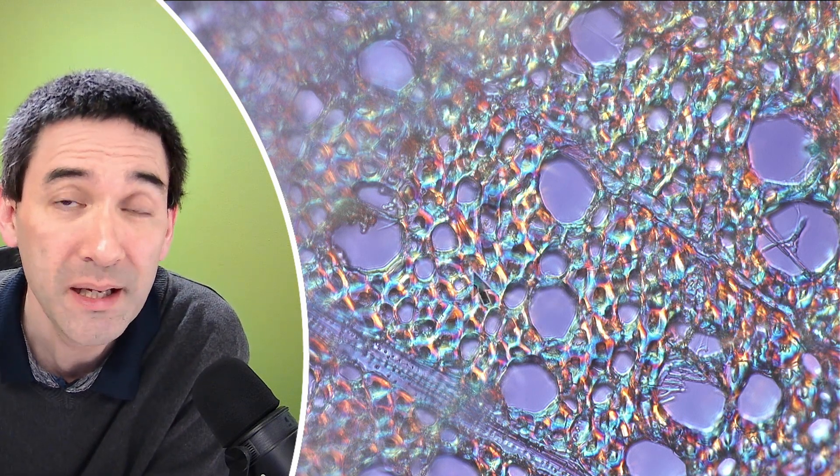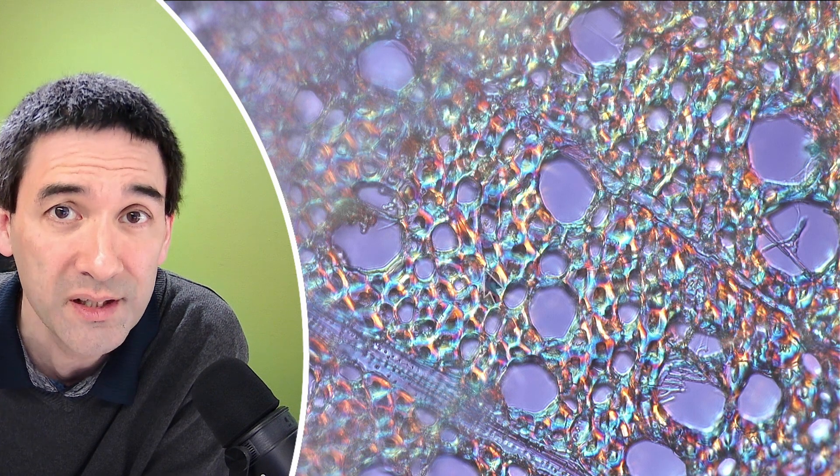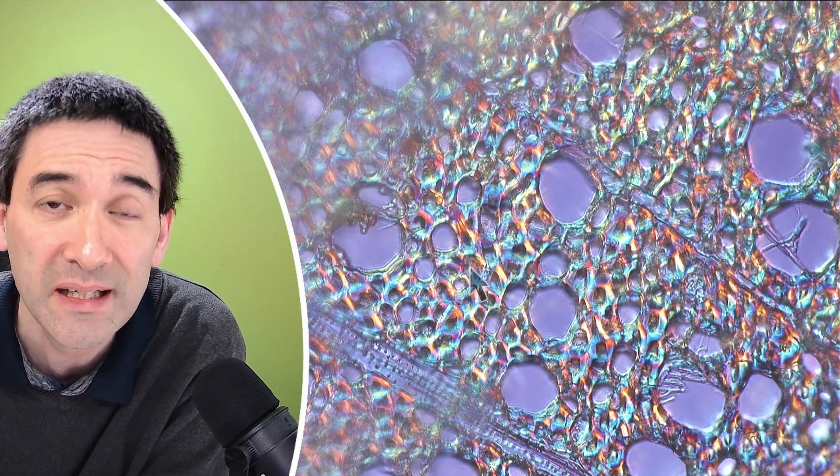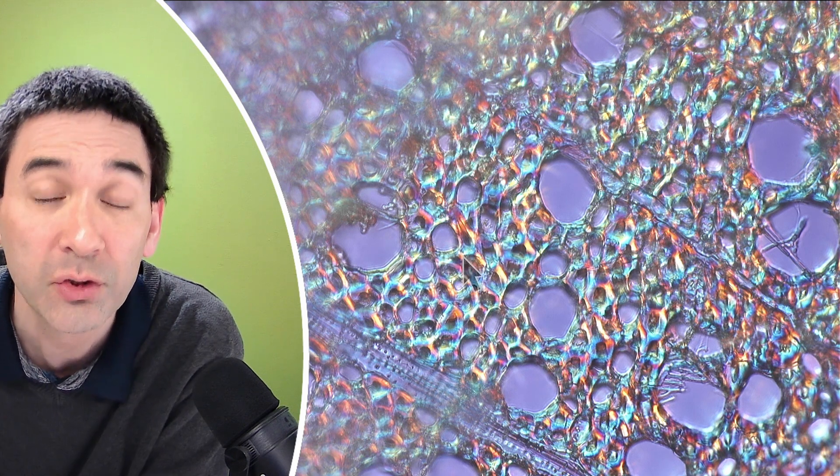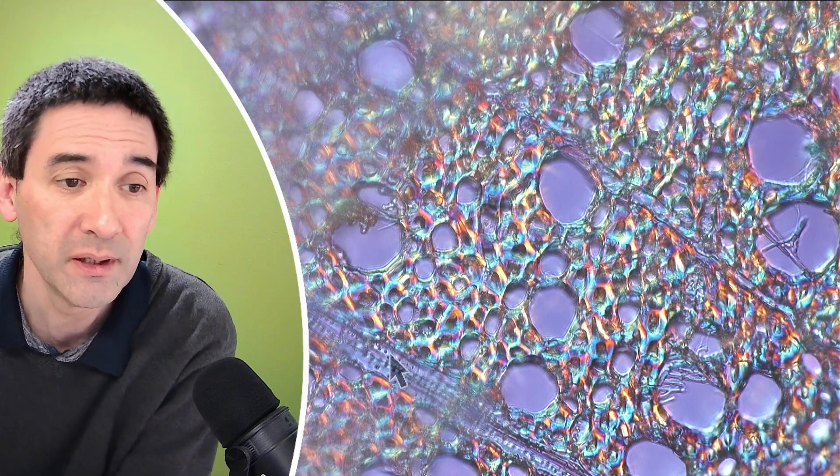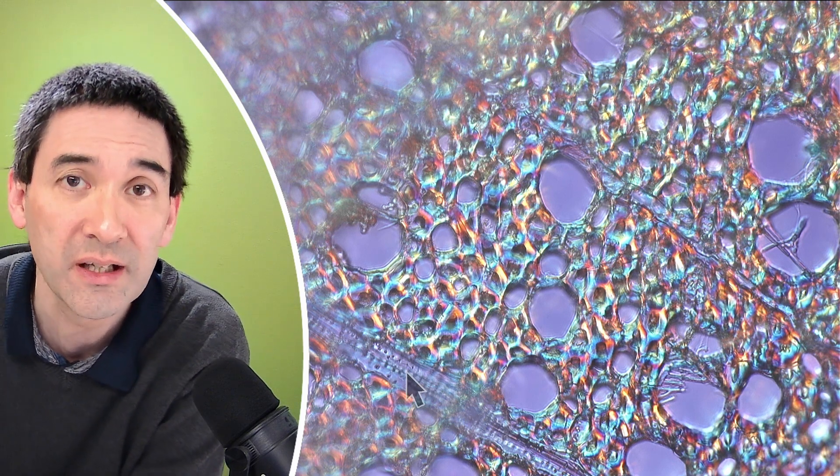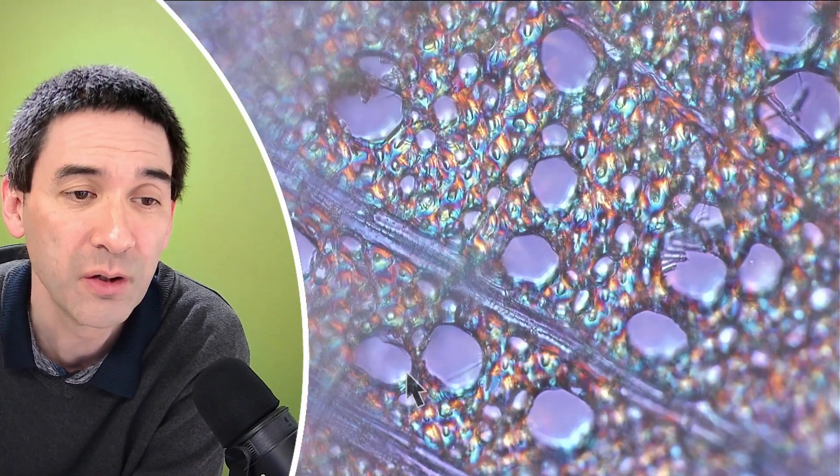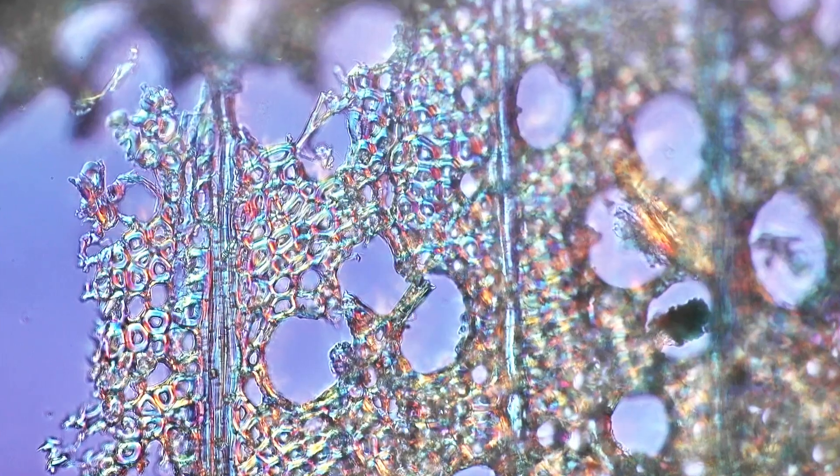Basically there's no cell contents because we're looking at the inside of the wood. The living part of the tree trunk is actually on the outside. You've also got cells that are running across like this to supply the different parts of the stem with water.